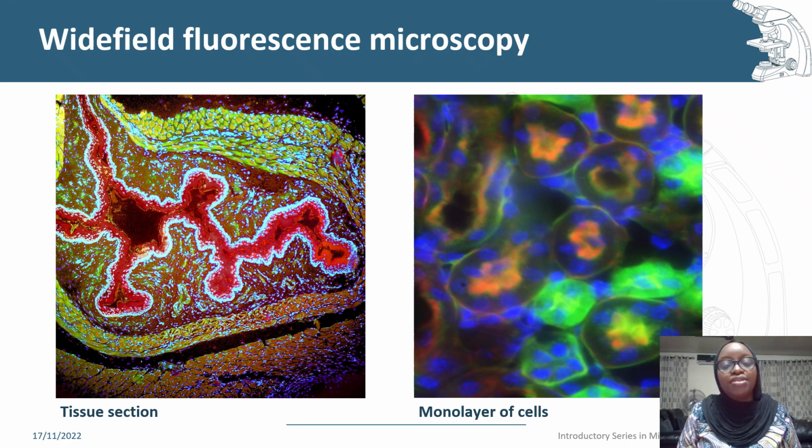Why is there a difference in clarity? In one case, all axial information is lost, and in the other, the image is blurry and we cannot see the detail, that is, the low contrast.